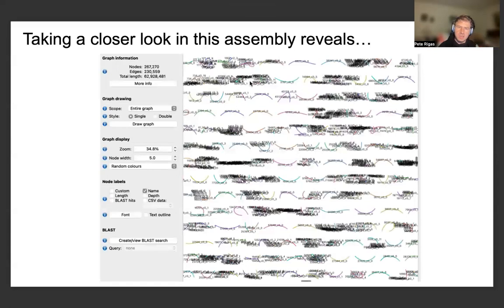And we can take a closer look in the assembly, and we can observe the point that we just mentioned, in which there can be many types of graphs, and they can have a higher node count, which reflects a higher probability of having more sequences in the FASTA file from the transcriptome assembly in Trinity which overlap. But not only this, there can also be more variety in how linear segments and forks are distributed in each one of the possible candidate graphs that Bandage can produce for our studies of the transcriptome assembly pipeline.